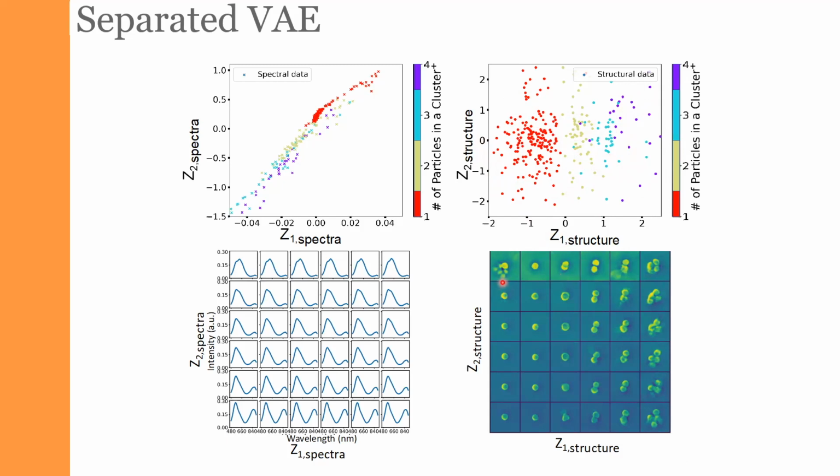If we look at the latent representation, we can see exactly the same behavior. So you can see that here we have the monomers. If you go from left to right, then they become dimers, and then they become something more complicated. In fact, it almost feels like we can ascribe some meaning to the Z2 latent dimension. So it's not clear exactly what happens here. It seems to be some residual variation of the contrast, but it definitely did not collapse.